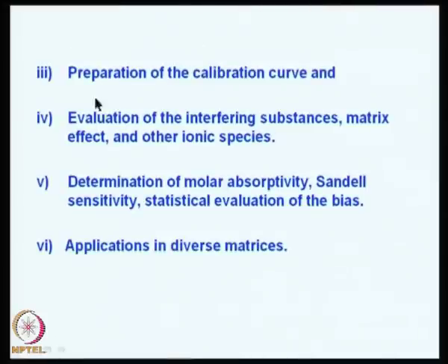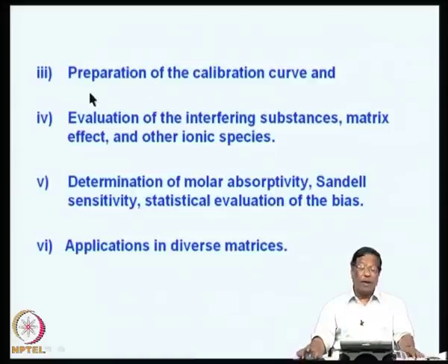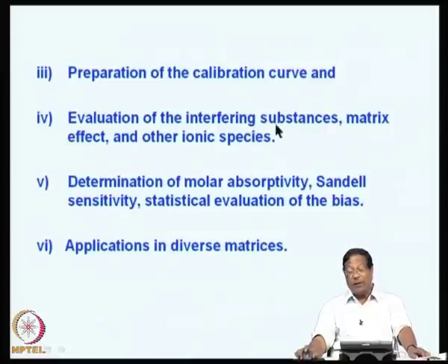How long the calibration curve is followed, that is, the linearity of the spectrophotometer, you have to determine. That means, for up to 5 ppm, 10 ppm, 20 ppm depending upon the system. Now, you can evaluate the interfering substances and matrix effects and other ionic species. For example, you may like to determine gold in sea water.